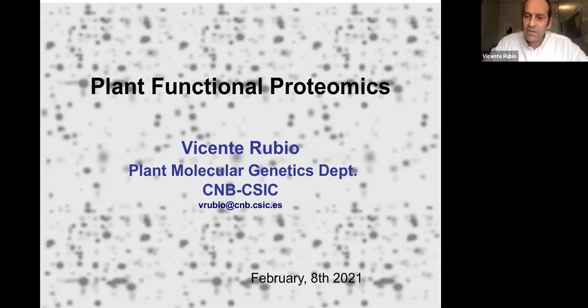And in the end of the talk, I will move to the proteomics tools or techniques that we use to identify protein complexes, particularly from Arabidopsis in our lab. But also, as I said, we are moving also to other systems.